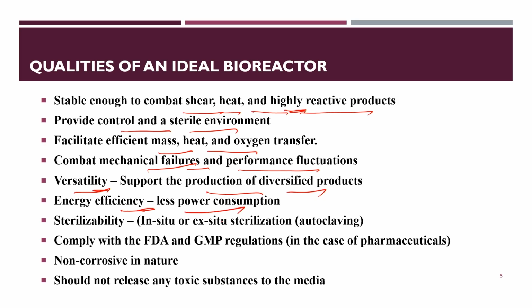Energy efficiency, it should be designed to utilize less power. Sterility is very important. There should be provision for in situ as well as ex situ sterilization, and, very important, it should comply with FDA and good manufacturing practice regulations if you are producing pharmaceuticals.